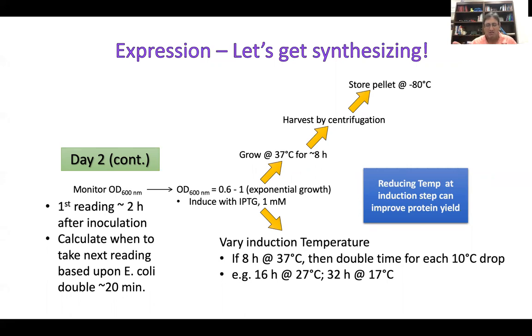So once you get started, after about 1 to 2 hours, depending on how everything you've done, that optical density or the OD 600 will get to be about 0.6. That's when I like to induce with IPTG. If you have problems with cells where they stop growing because the protein you're making is deleterious to the cell, maybe you want to get a higher density before you add IPTG. So you have lots of cells making some protein versus a modest amount of cells growing and dividing and making protein. So there's different tricks to this.